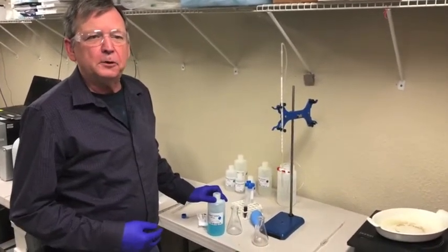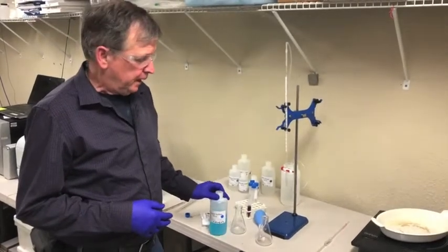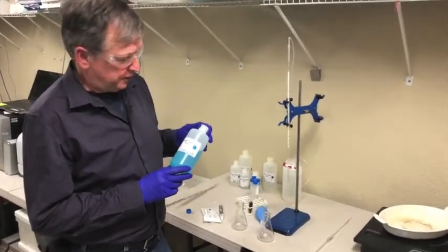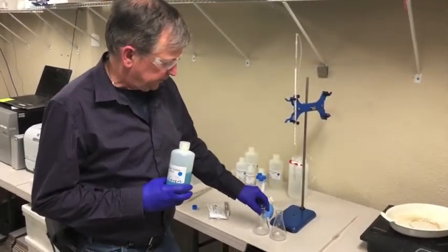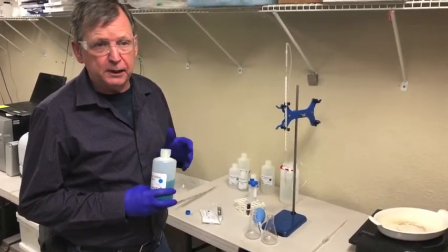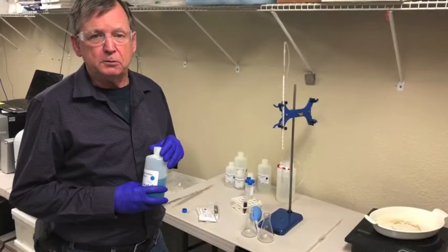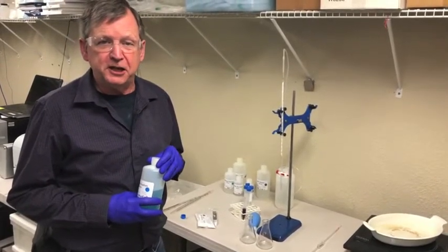While we're waiting for our sample to settle or centrifuge, I'm going to go to the next step: prepare the reaction flasks. We're going to pipette exactly 10 milliliters of copper sulfate reagent into the reaction flasks, then add what we call the binding reagent, which creates the alkaline conditions necessary for the sugars to react with the copper before we proceed to the titration.